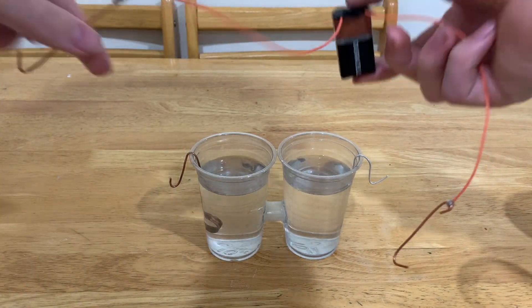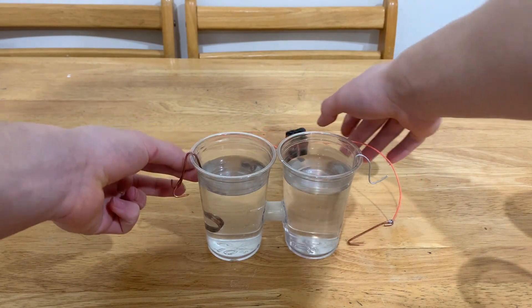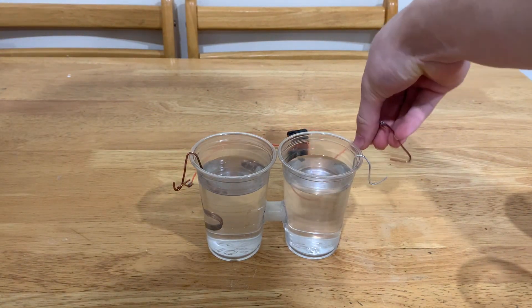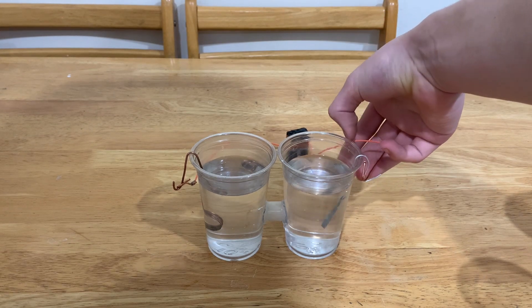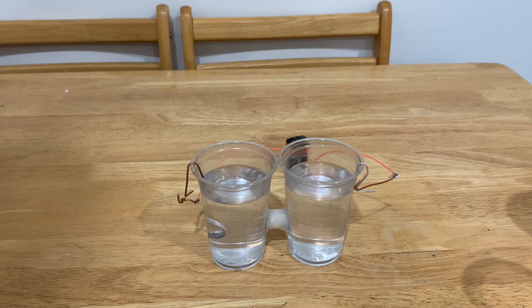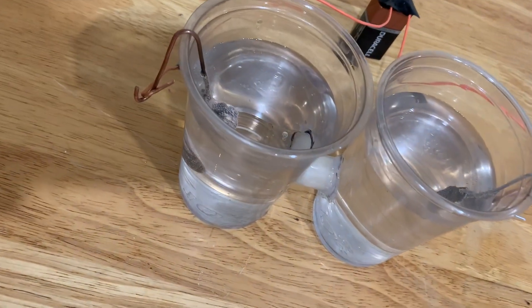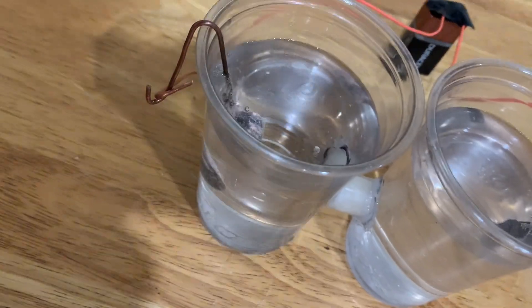Now we attach a 9 volt battery to this thing — negative on copper, positive on the aluminum side. You should notice nearly immediately that on the side with the copper, there are small bubbles beginning to rise. That would be hydrogen.